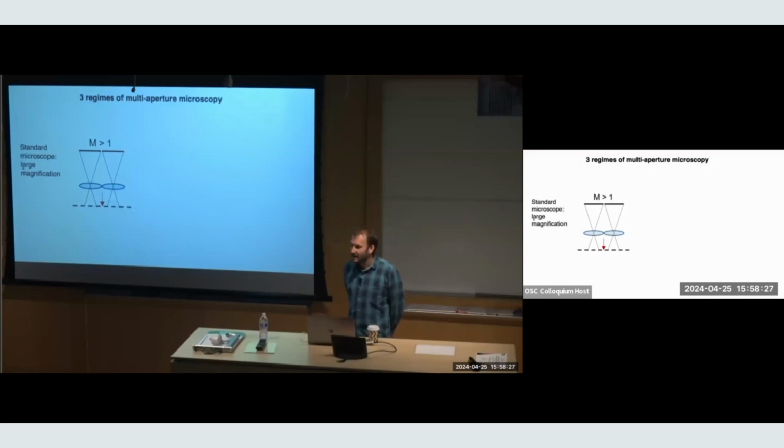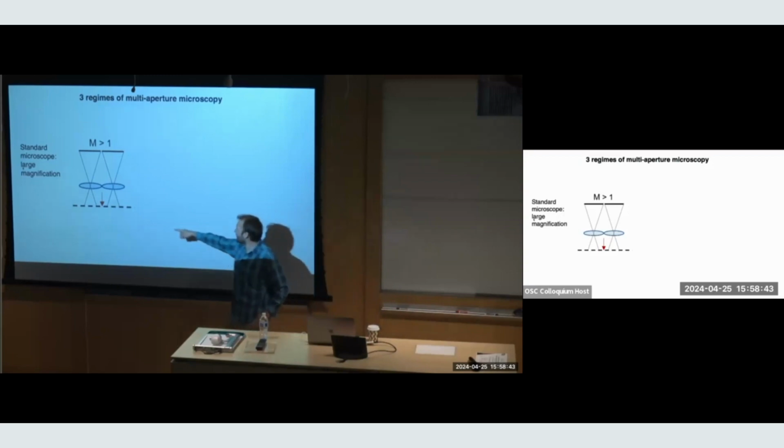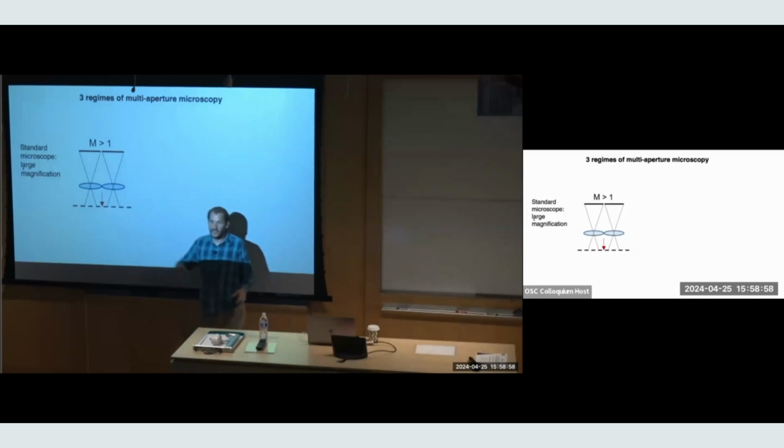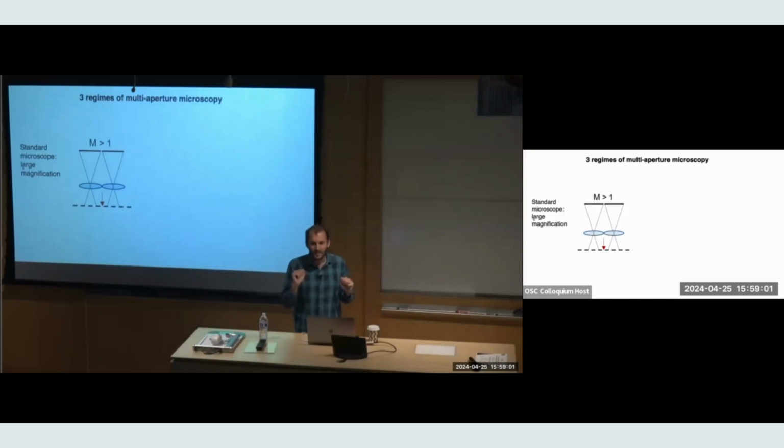And if you drew a little diagram like I drew here, you'd quickly see why it's maybe not the best idea originally. If you have a microscope, usually you're magnifying an image, right? So you have a spot in the real world that's being projected to a larger image, where I'm drawing at the top an image sensor. And so if you have a magnification setup and you put two microscopes together side by side, you'll always be left with a gap, right? An area you can't see. And so that's not great for the original goal I set out to achieve.